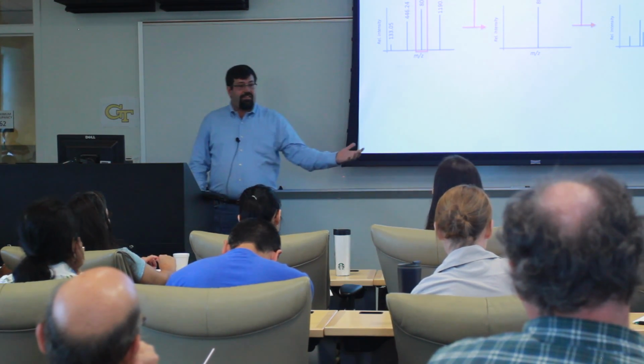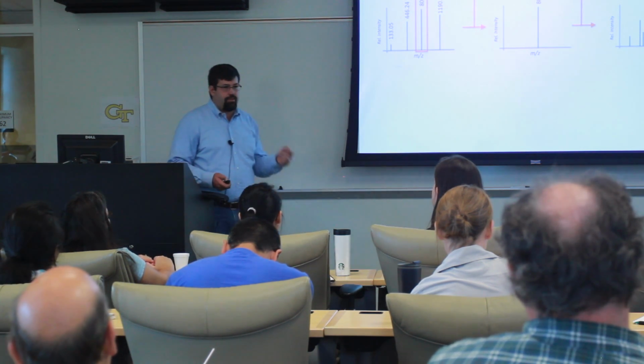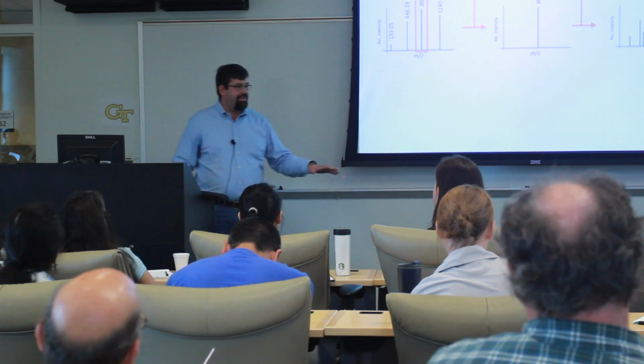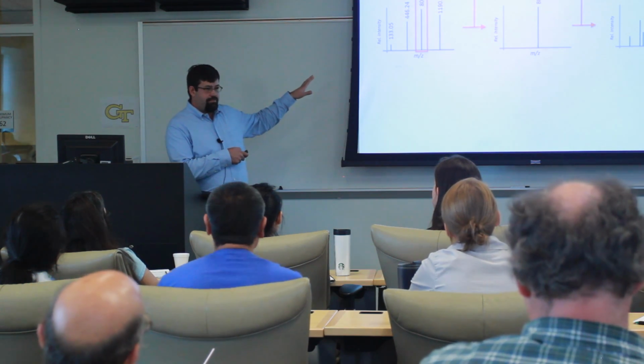Those can sit on the shelf. They can actually sit on the shelf for a long time, and that's one of the advantages of using MALDI. So you can spot samples and then let them sit. Take them to the mass spectrometer, collect an MS spectrum.